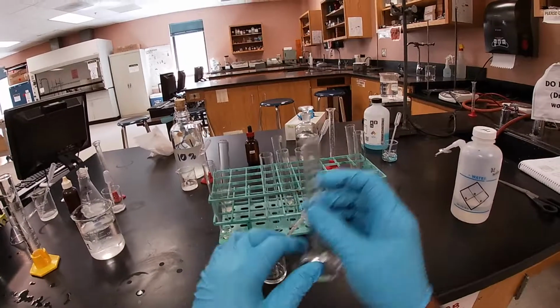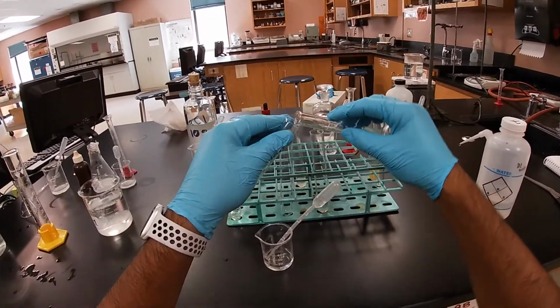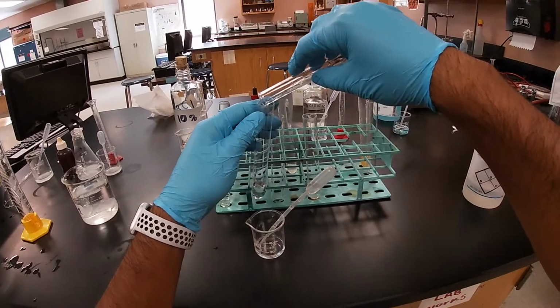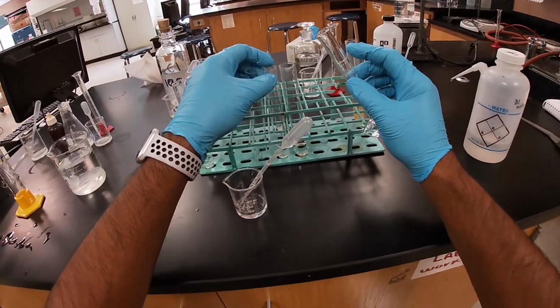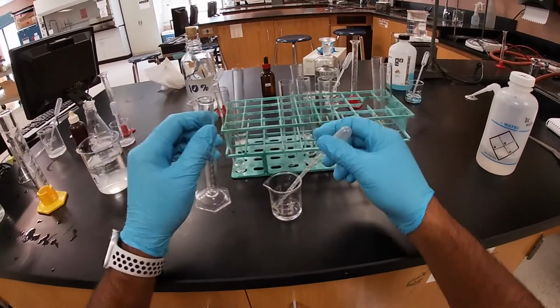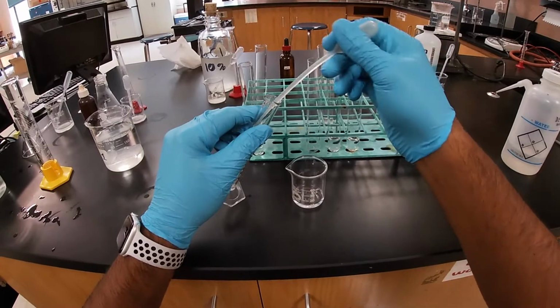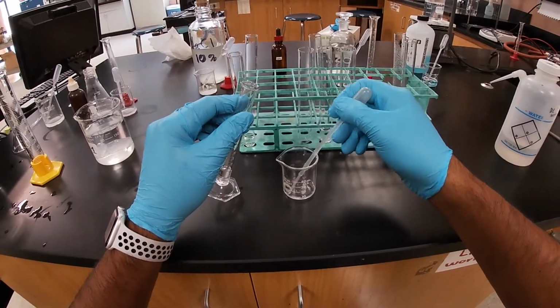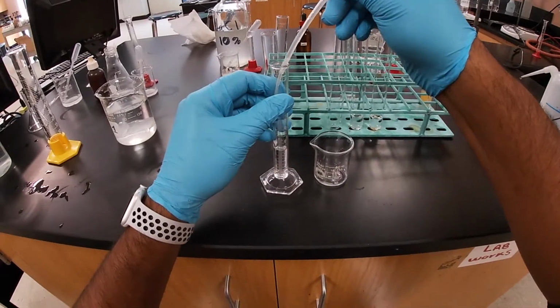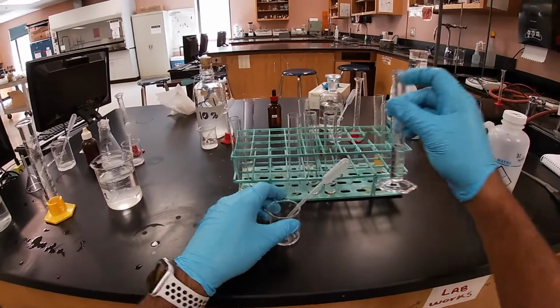And we got our 5 milliliters. Let's go ahead and put in our second one. Alright, and then the last one. And there we go. We got our 5 milliliters.